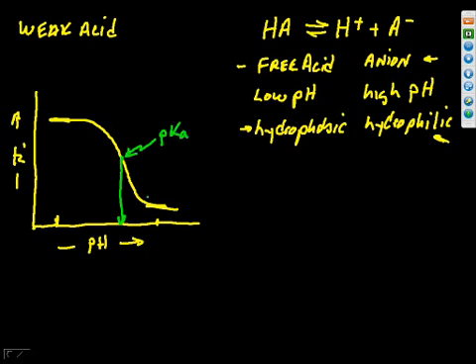And that's the pH at which the analyte behaves as though it's 50% ionized, or is ionized 50% of the time. And what you expect to have happen then is as you change the pH, of course, the degree of ionization is going to change. Now, pH is a logarithmic function. That means that a 1 pH unit change is a 10-fold change in the concentration of hydronium, to be specific.